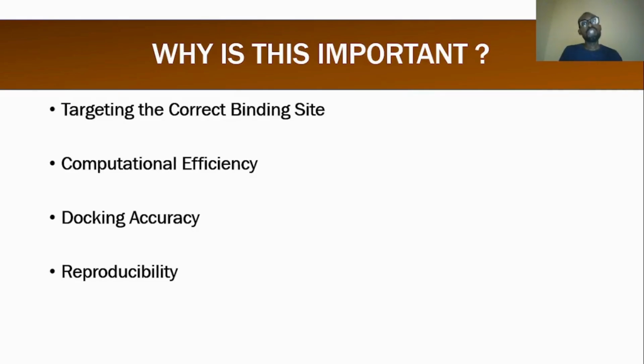Also, your docking will not be considered to be accurate if you are not working with the dimensions of the active site. It will not be considered to be accurate, because the question is, how do you know if your results are correct, since the protein has a large surface that you can dock with? So with the dimensions of the active site, it gives your result some form of accuracy.